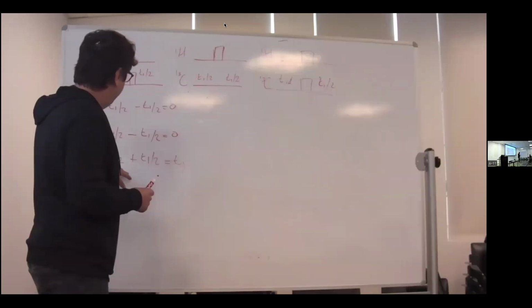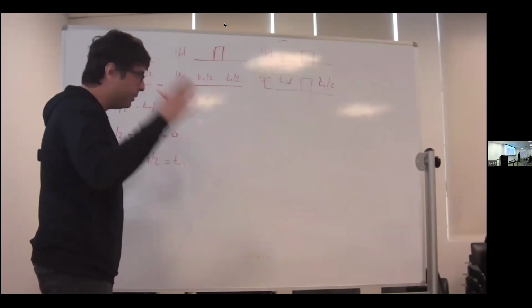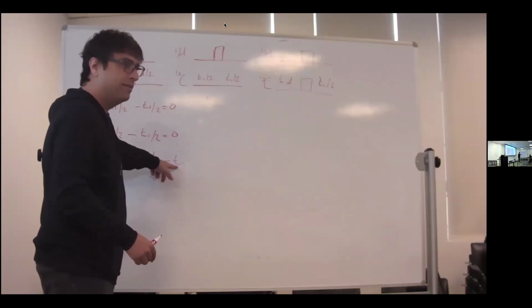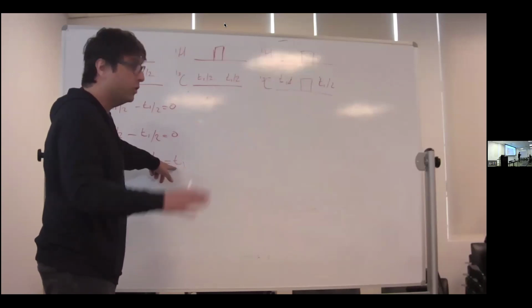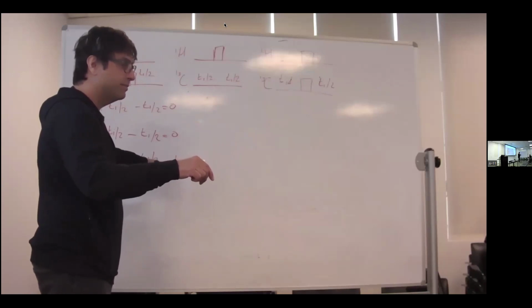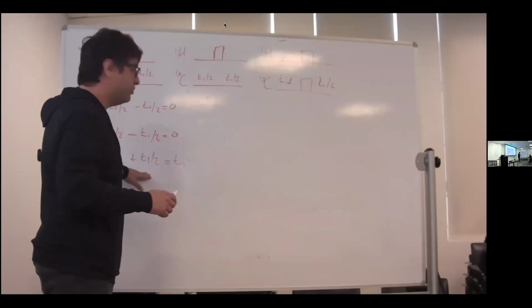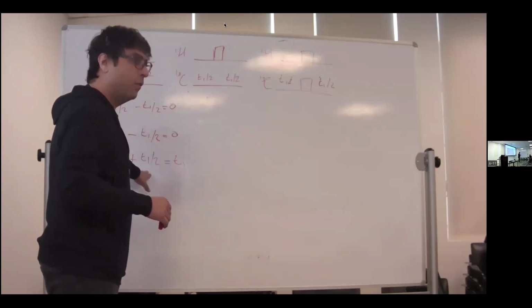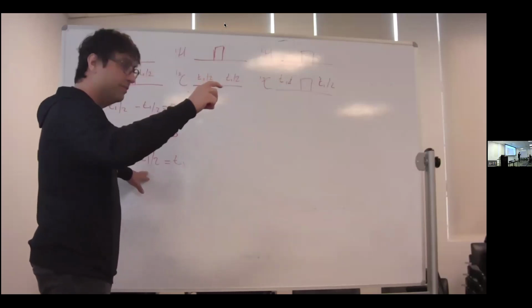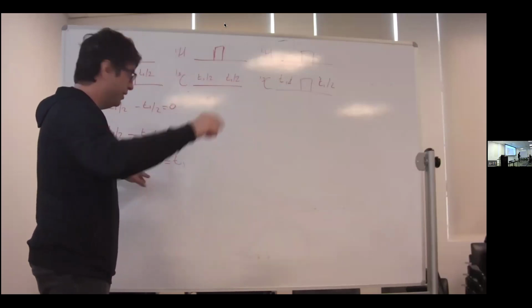So now the proton dimension, you've got the proton spins. What am I going to see in the indirect dimension? The evolution is cosine pi J t1. What does that look like when I Fourier transform? There's no chemical shift, right? It's a doublet, centered on zero. Exactly. This is what's called J-resolved spectroscopy, where the indirect dimension is just the splitting. So it's literally just two peaks, no chemical shift information. And this is called J-resolved.